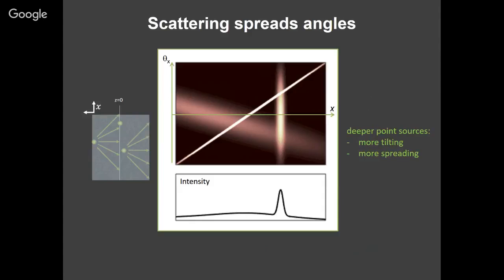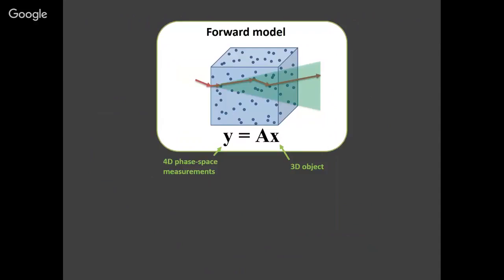And so that's a very strong physical model that we can use as a prior in an inverse algorithm. So now we don't want to fit this to lines, because obviously we would never recover this sort of big blob in the background, but we want to fit it to blobs of a particular tilt angle. And this is all happening in 4D. I'm only showing the 2D slice, right? So you can just set this up as a y equals Ax problem.